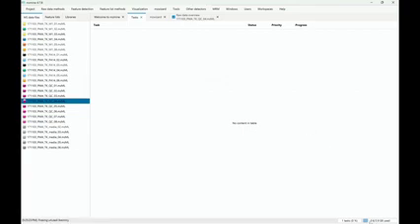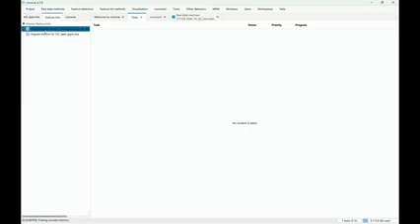And I can always, in the bottom right, there's this used memory indicator. And mzmine is Java, and it's basically always going to grab a lot of memory if it's available, because then it's faster. But if you double click on that bar, it's going to clear out the memory and tell you, I only need 600 megabytes to visualize all that data, to also have the feature tables.